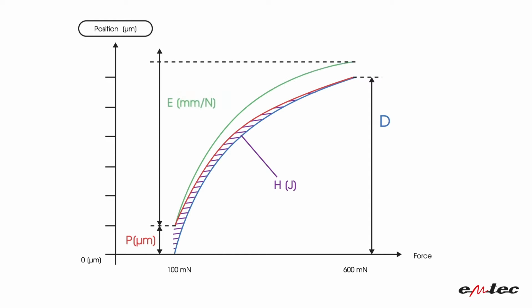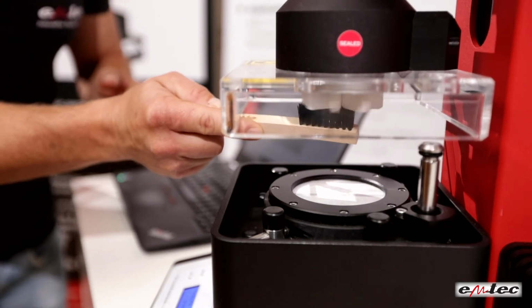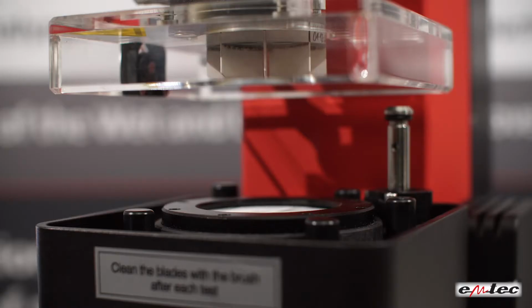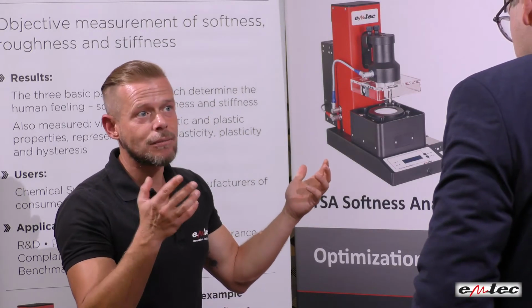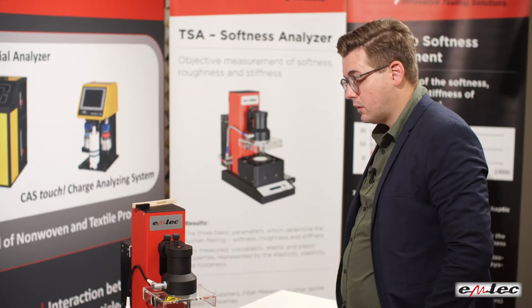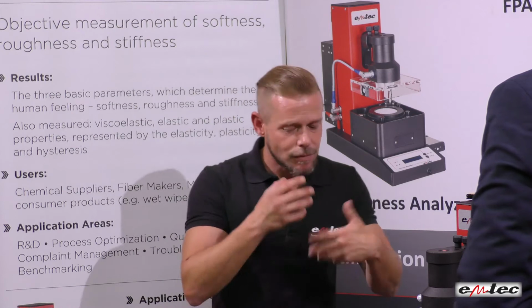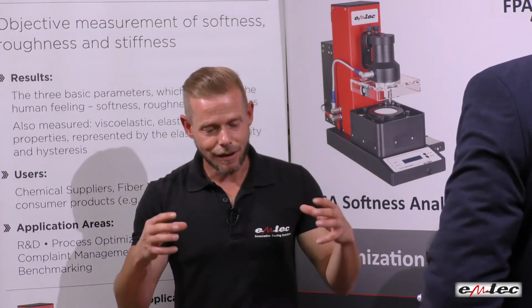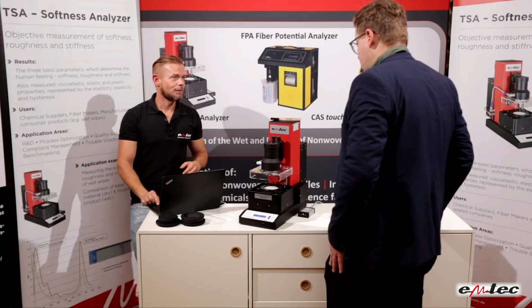Very interesting, for example, if you want to compare, because you can also measure wet material with the instrument, so you can compare dry and wet sportswear, for example, and normally, you can see from the results, you can stretch wet material more. And this again has a certain influence on the quality. You know, how comfortable do you feel in the clothes? Yeah. So this is what you can do with the instrument and what happens.